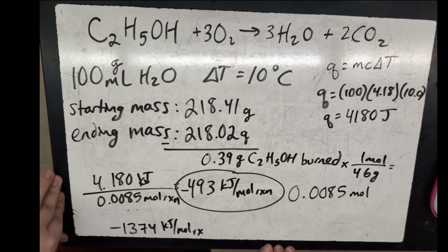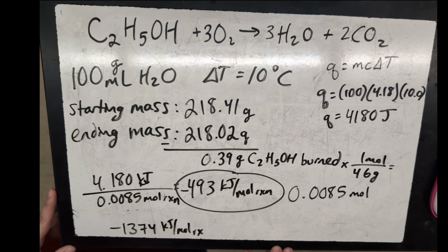But yeah, it didn't take too long to do this experiment. Sometimes I'll have them do multiple trials and find an average, or we'll find a class average. But either way, you're not going to get the best results. But it's a good one because you'll see questions like this on the AP exam pop up once in a while.